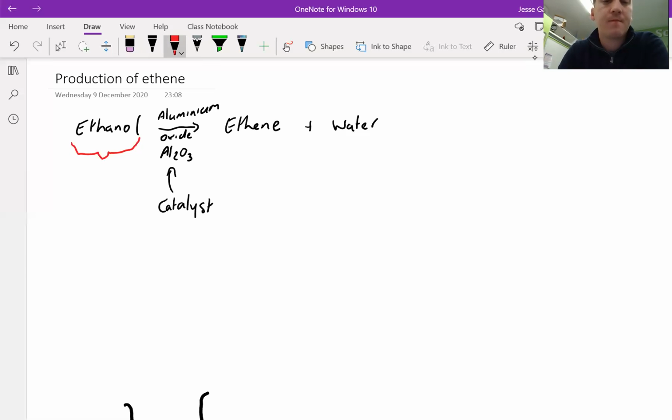What does that mean? So on 3, I want you to speak your answer out loud to the screen. 1, 2, 3. Hoping that you said ethanol is the reactant. So it is a single reactant in this experiment. Aluminium oxide is a catalyst. It is not a reactant.